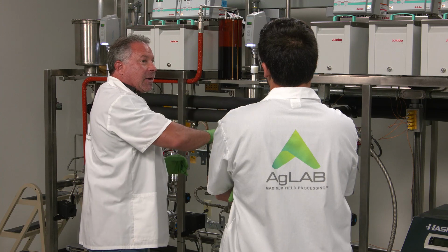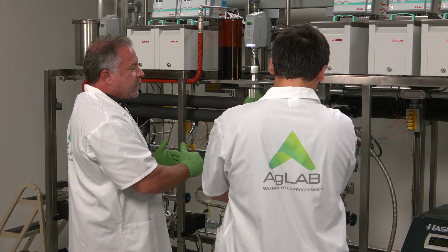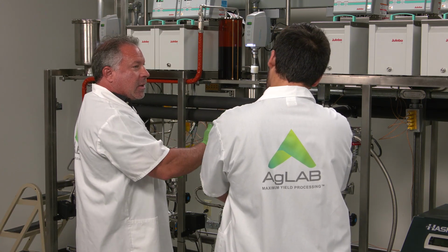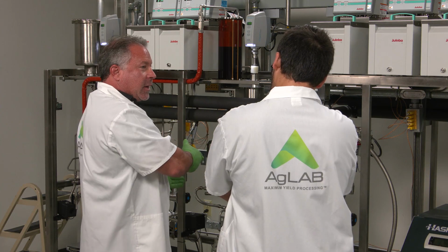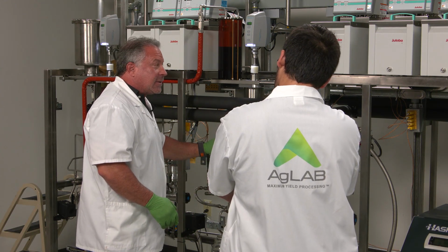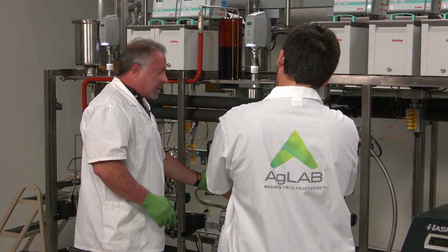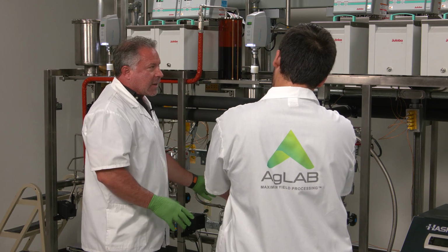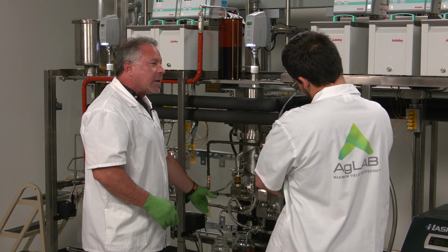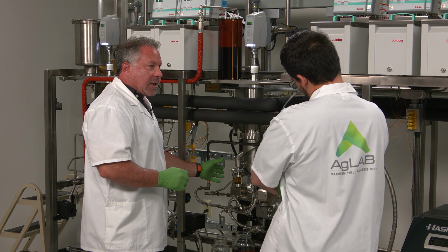It wants to come off because we're giving it enough energy to vaporize that molecule and leave everything else behind. When we leave everything else behind, all our fats, lipids, chlorophylls, all that stuff, very heavy molecules come off on this side over here. That's our waste stream. We're trying to get as little amount of cannabinoids in there as we can.